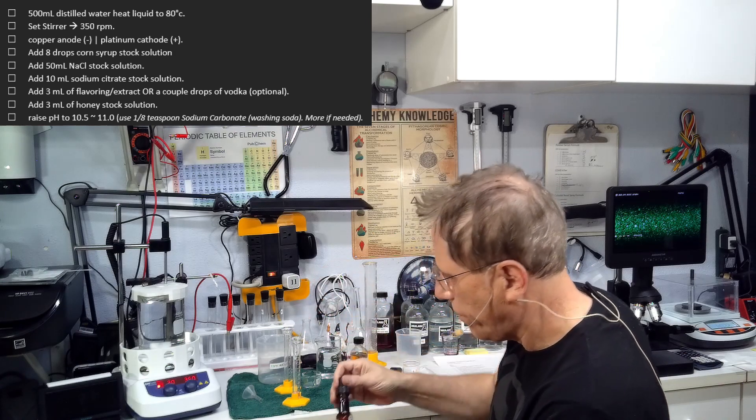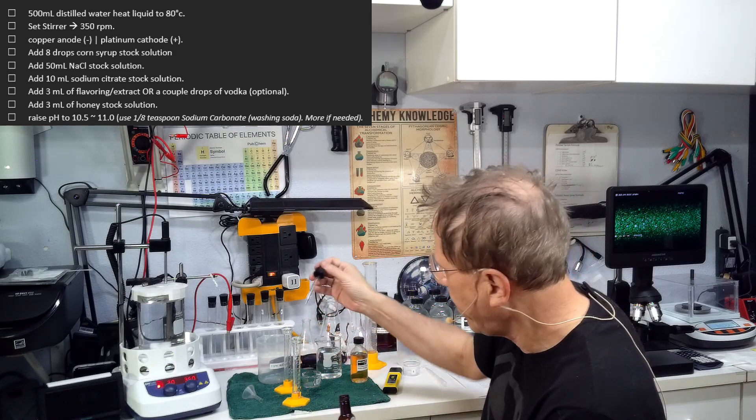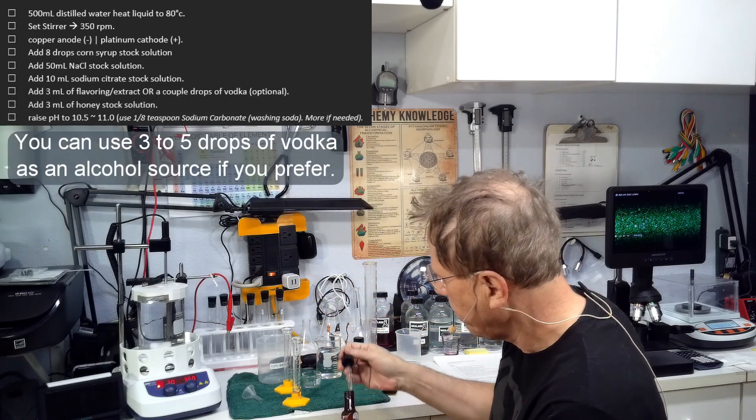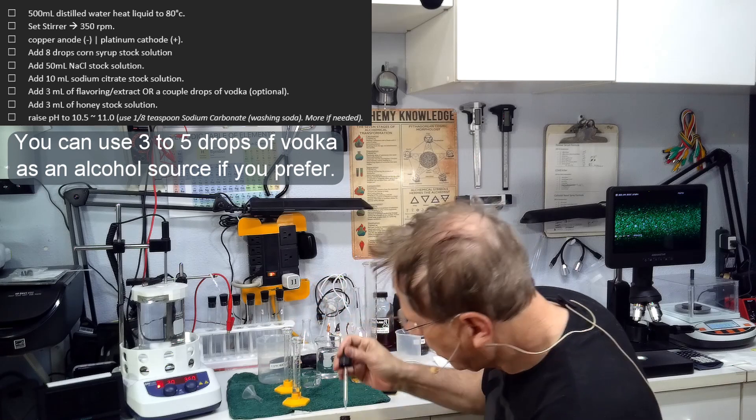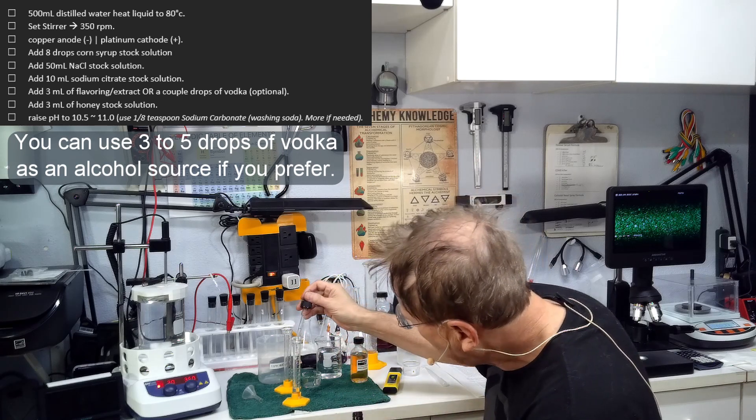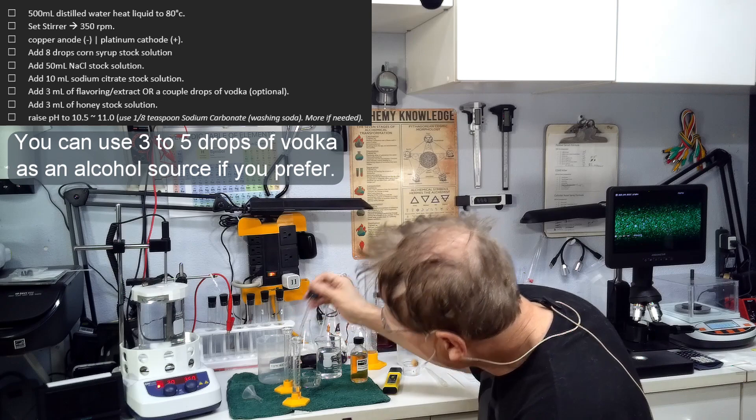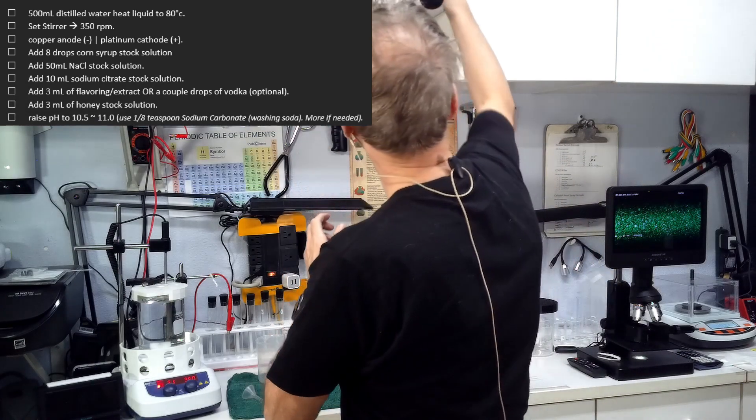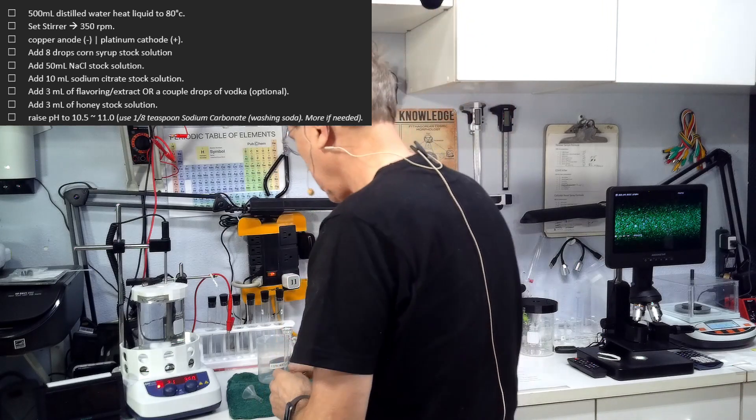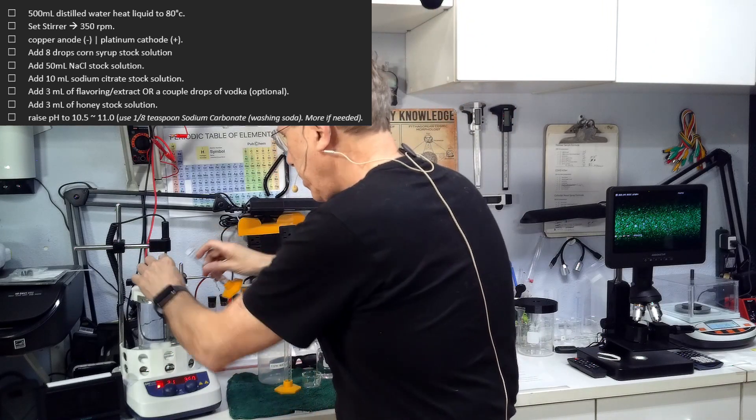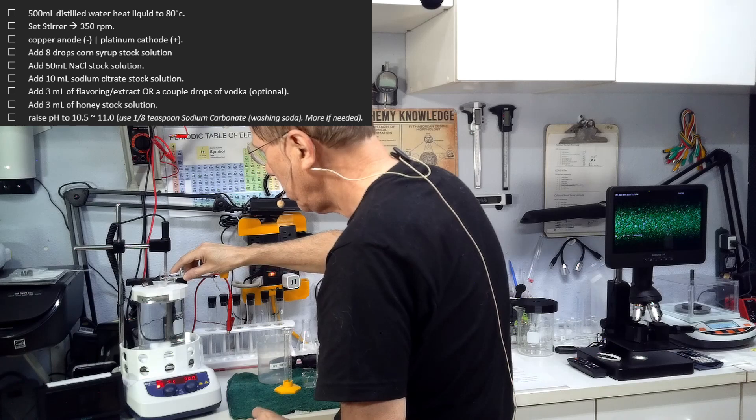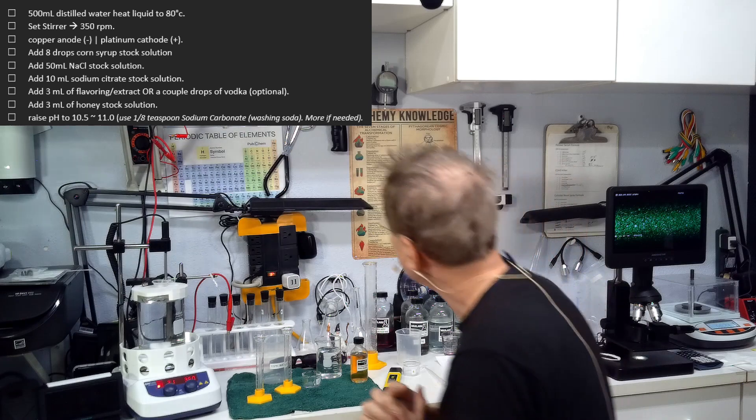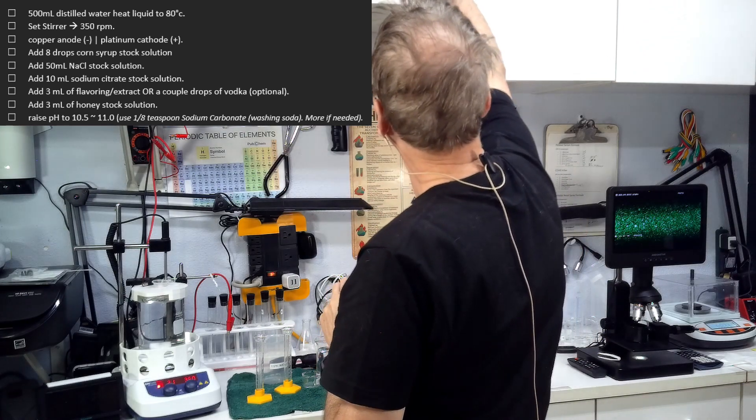Now I'm going to add flavoring extract. Three milliliters is the minimum. This is vanilla flavoring. If you want a stronger taste you can use more. What we're using out of the flavoring is the alcohol that's in the flavoring.